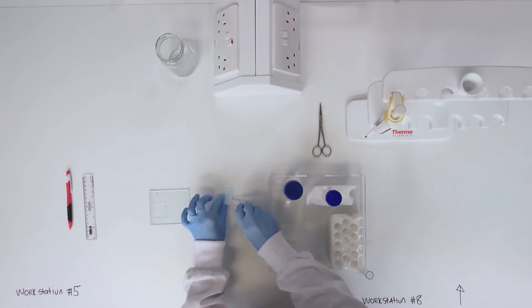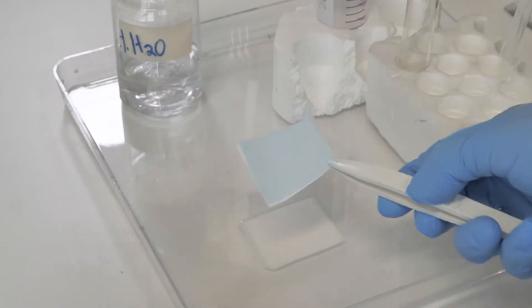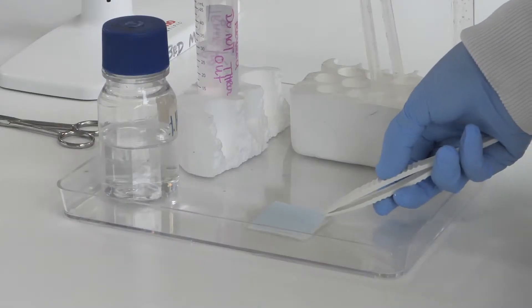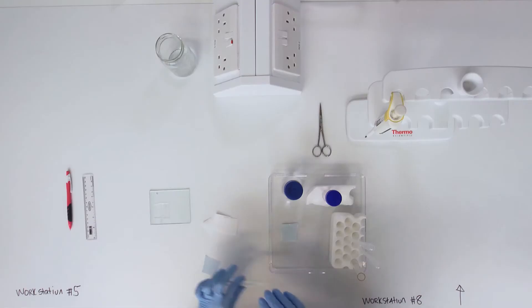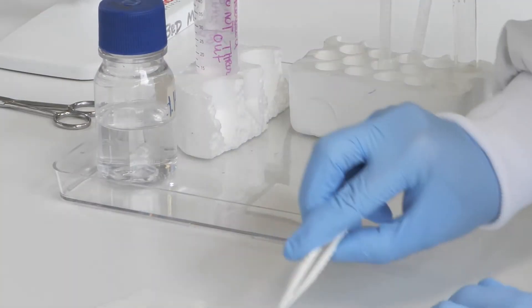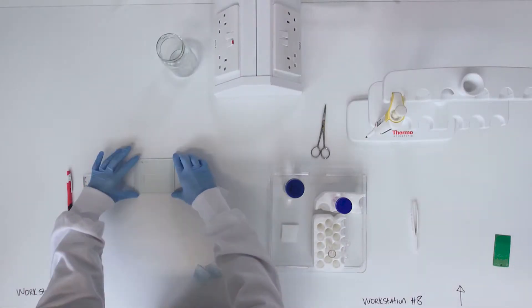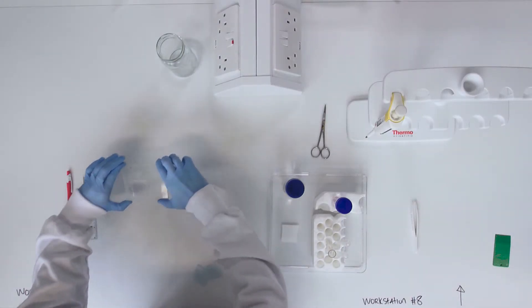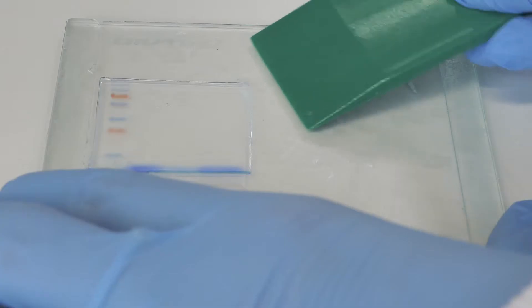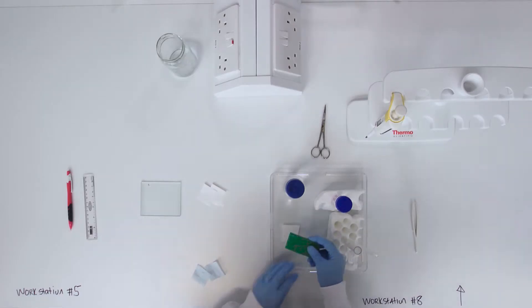Now add the nitrocellulose membrane and gently remove the two blue paper sheets. Ease the gel half off the plate and place the gel on the membrane, being careful to match up the edges precisely.